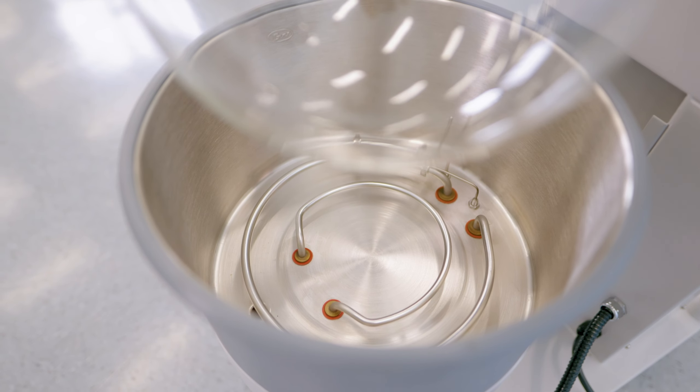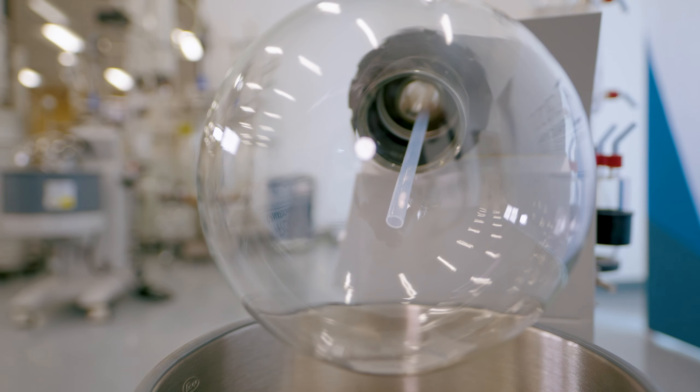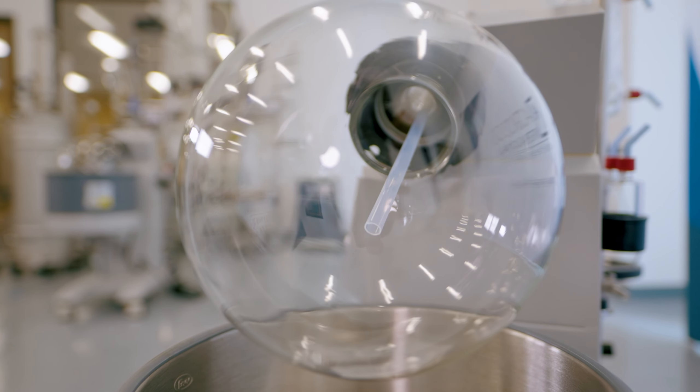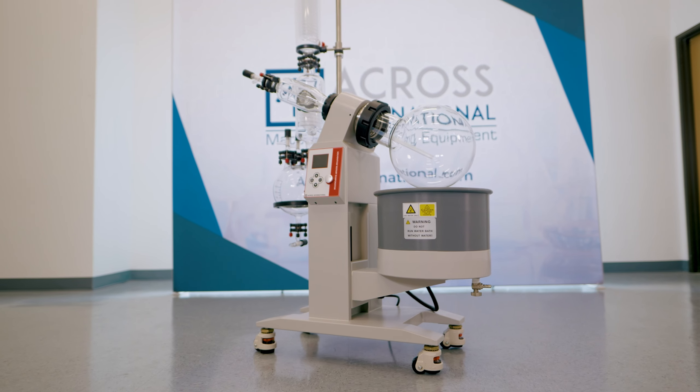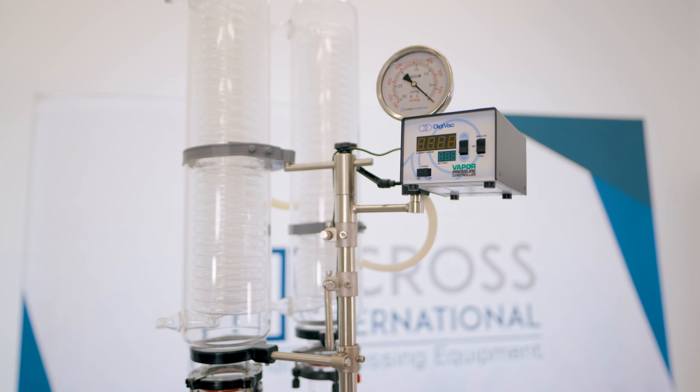Our line of Rotary Evaporators ranges from 2-liter benchtop units all the way up to large 50-liter systems. All AI SolventVaps feature a motorized lift as well as a central control panel where bath temperature, bath height, and rotational speed can all be controlled.